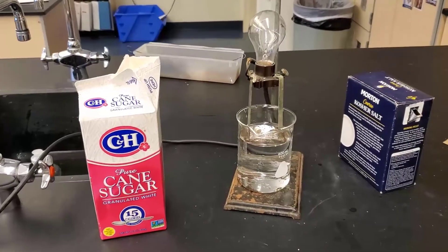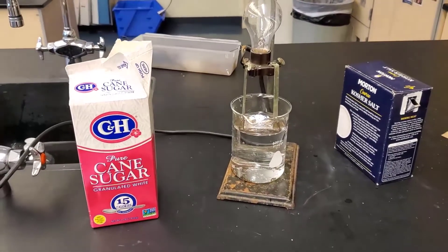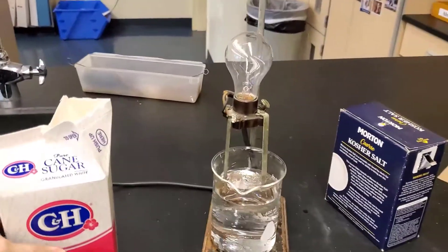We can use this property of ionic compounds to find out if a substance is ionic or not. So let's test table sugar and see if table sugar is an ionic compound. I've got my device plugged in and we're going to add some sugar and see what happens.